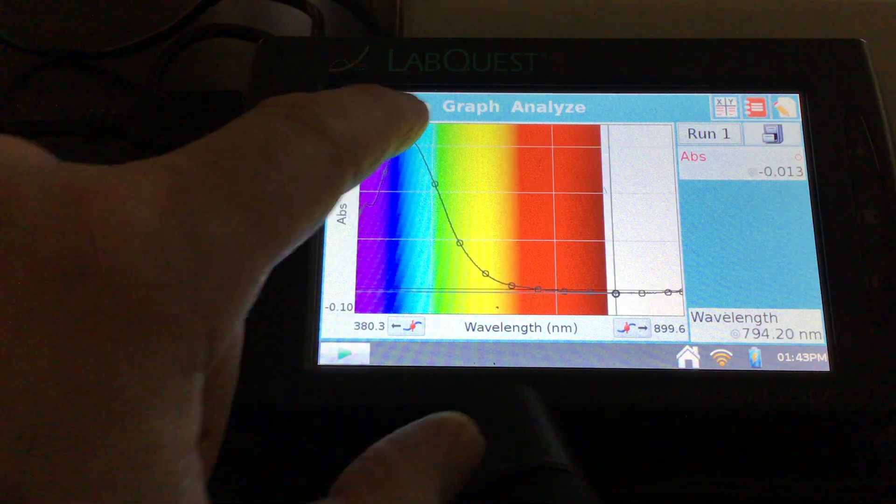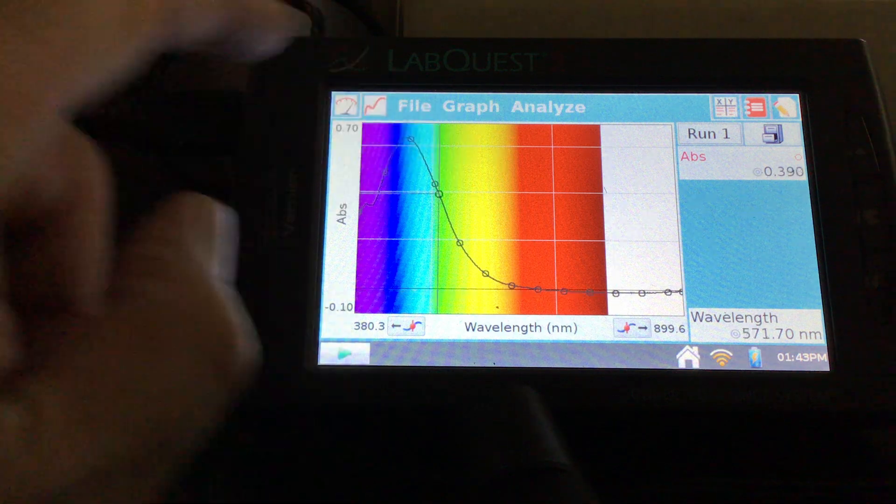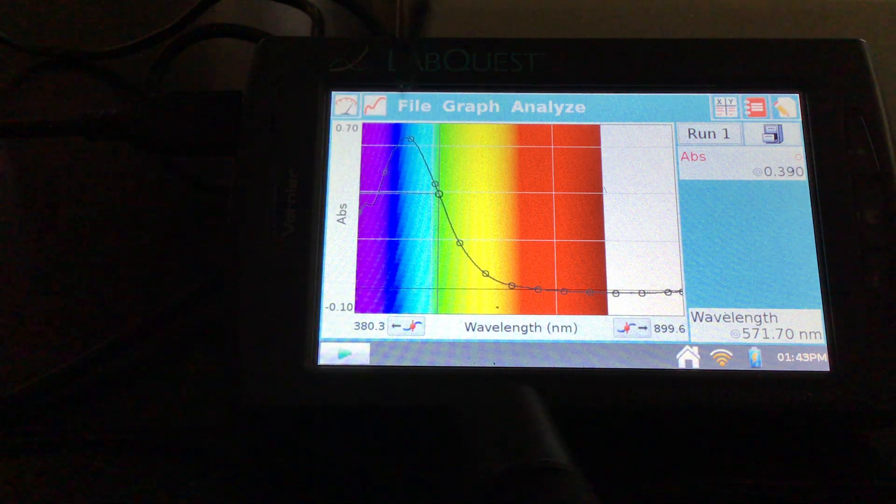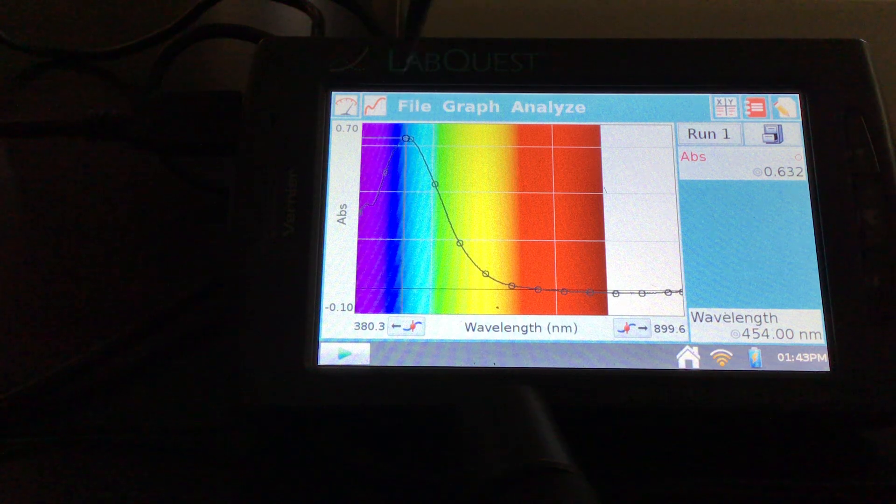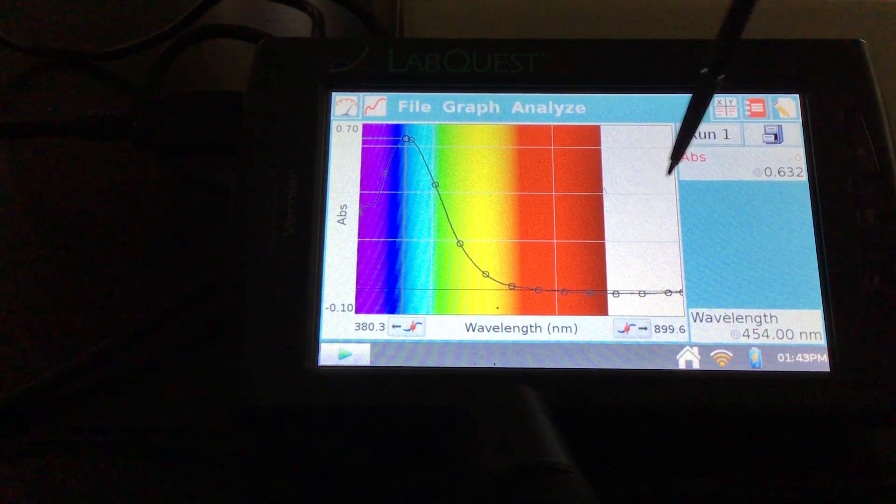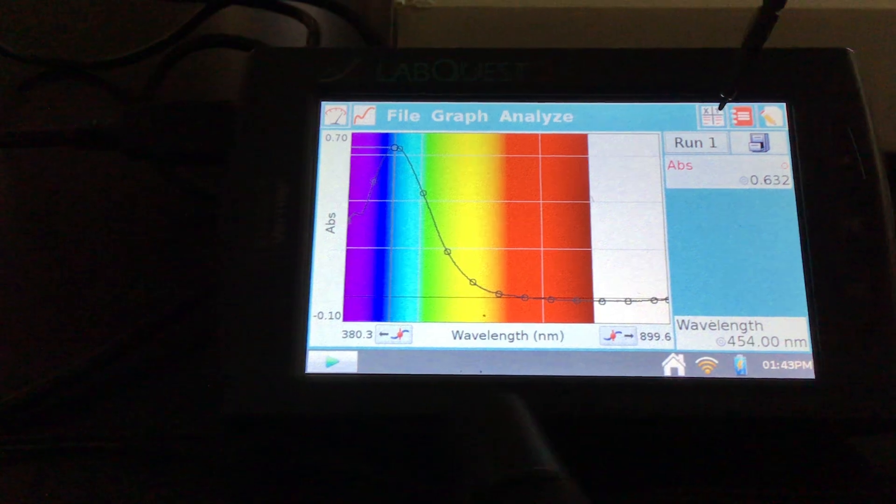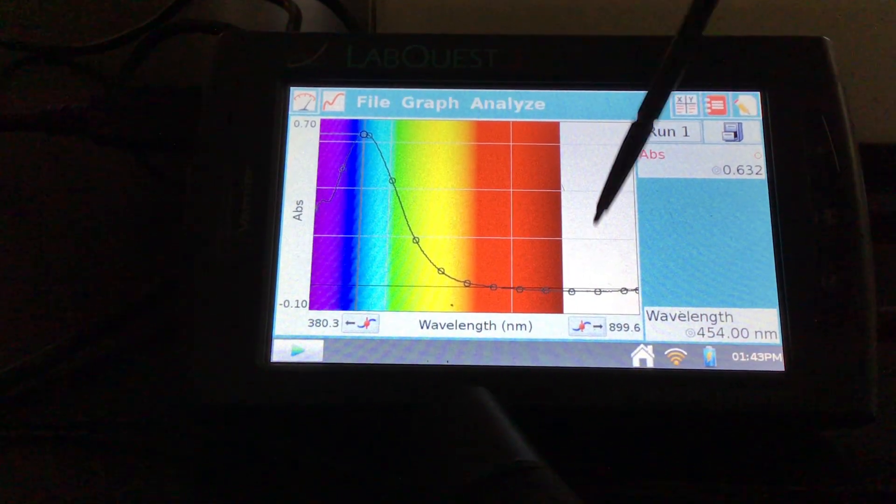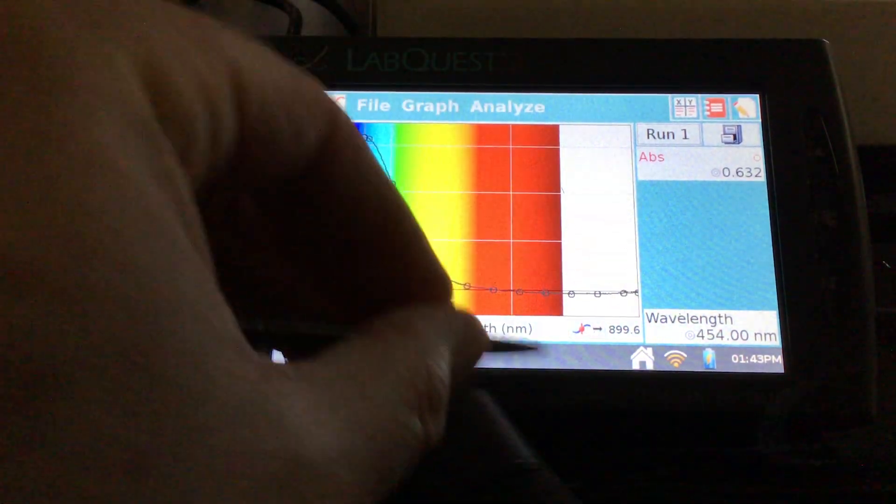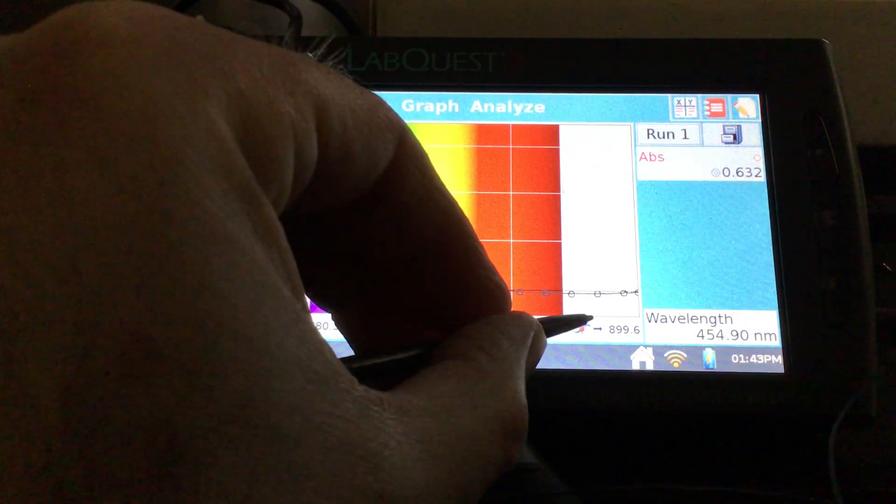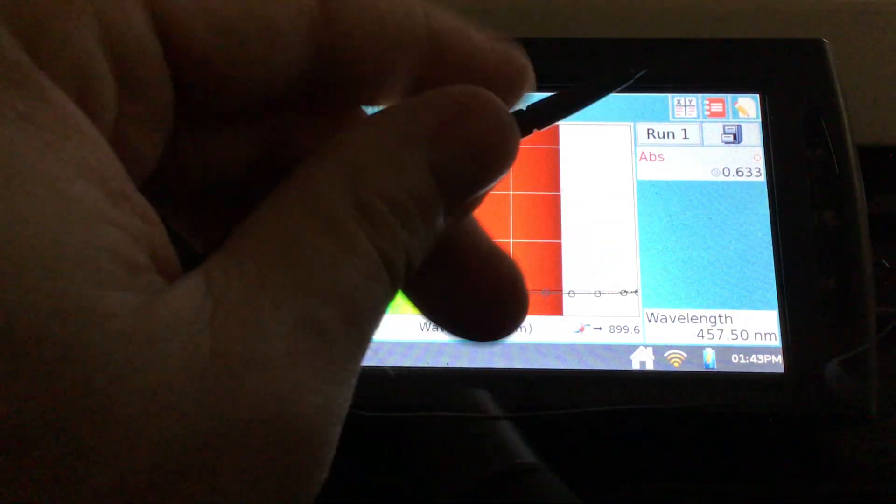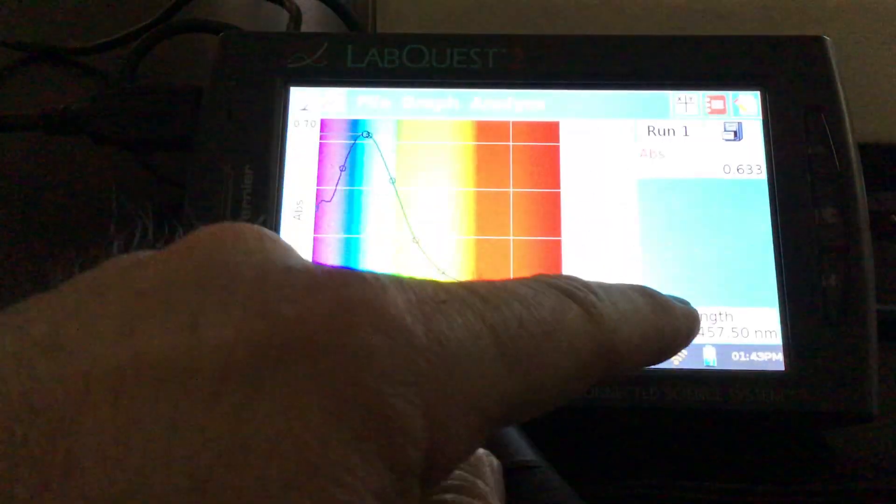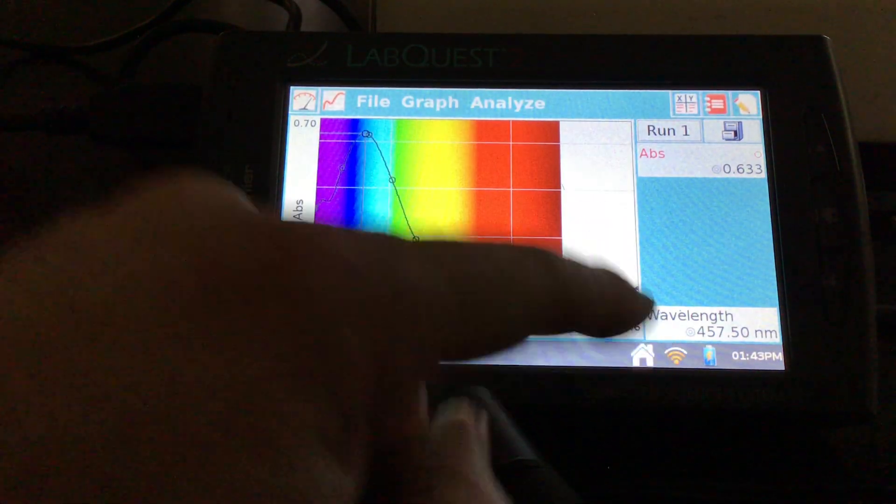There we go. And we're going to try to select that point near there. My finger isn't very good at that, so I'll use the stylus and kind of tweak it so it's really at the peak wavelength as we see up and to the right. So I can move that around just a little bit. It should be pretty good. That's about right. So my wavelength I'm going to collect everything at is here, about 457.5.